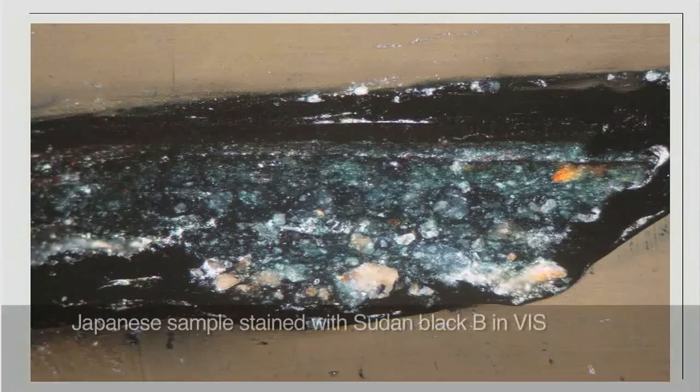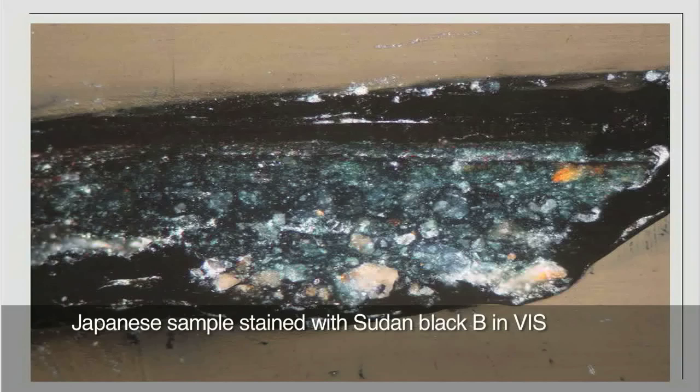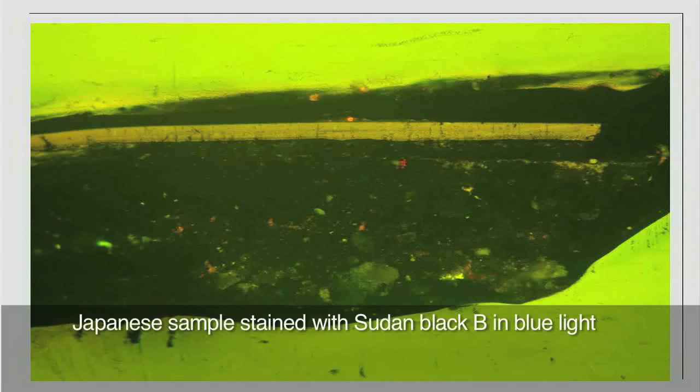After staining for oils, the Japanese lacquer sample showed a very regular staining in the foundation layers, which both have taken up a deep blue-black colour. If viewed under blue light, the sample further shows that the very top layer, which was previously fluorescing in bright yellow, now is stained entirely black. This suggests that the top layer is an oil varnish rather than an Asian lacquer, which would not have taken up any staining agent.